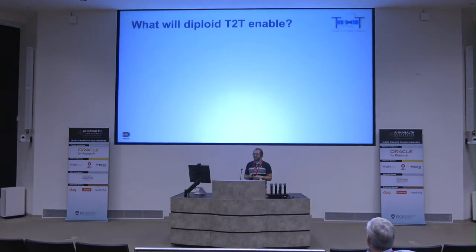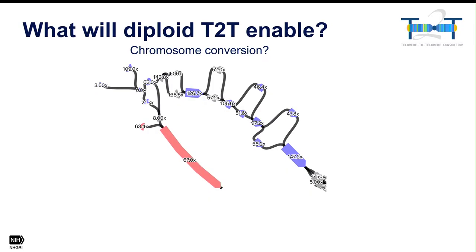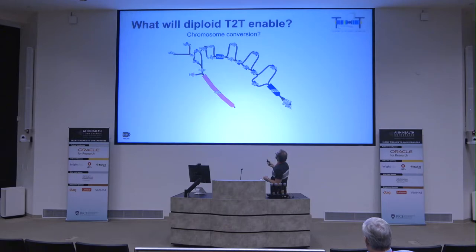There are also some interesting things we can see from the assembly graphs that is going to be interesting to replicate in other humans. So this is a region that comes from near the rDNA. So the rDNA big tangle would be down here somewhere. But the interesting thing to see here is that there's this part in blue. So all things here are blue, so this is coming from the father. But what you can see by the coverage is that it looks like there's two pretty much identical copies of the chromosome in the father, or inherited from the father, in this child, right?